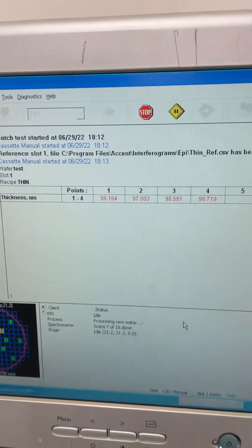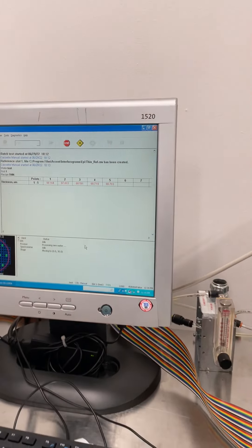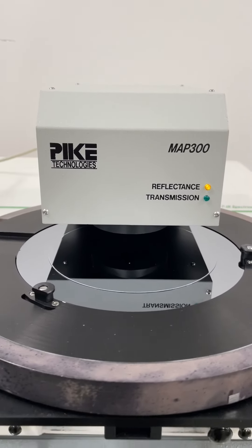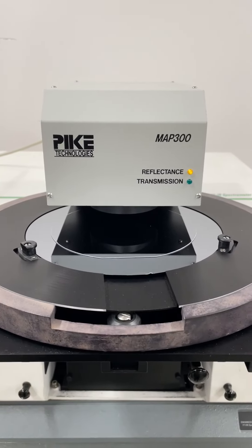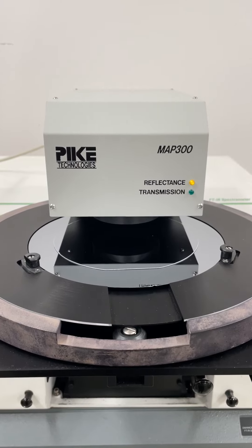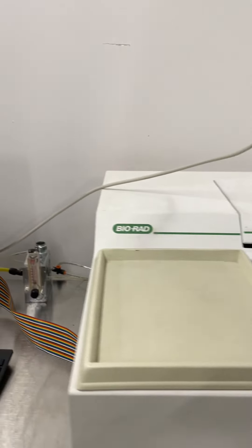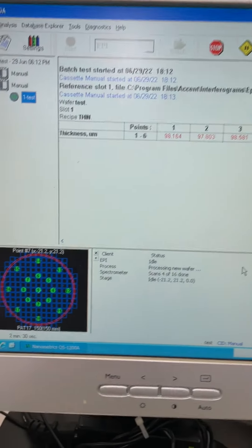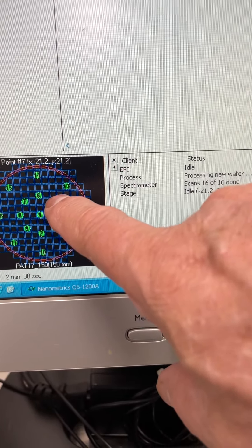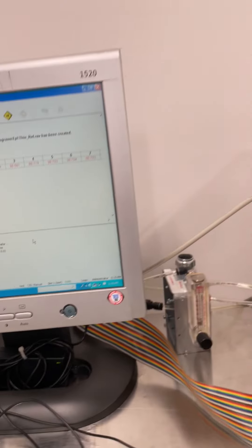It's still resolving 100 microns. What it just did was run through the right-hand side of the test points — from 2 through 5, and then it rotated back around to get to 6 through 9.